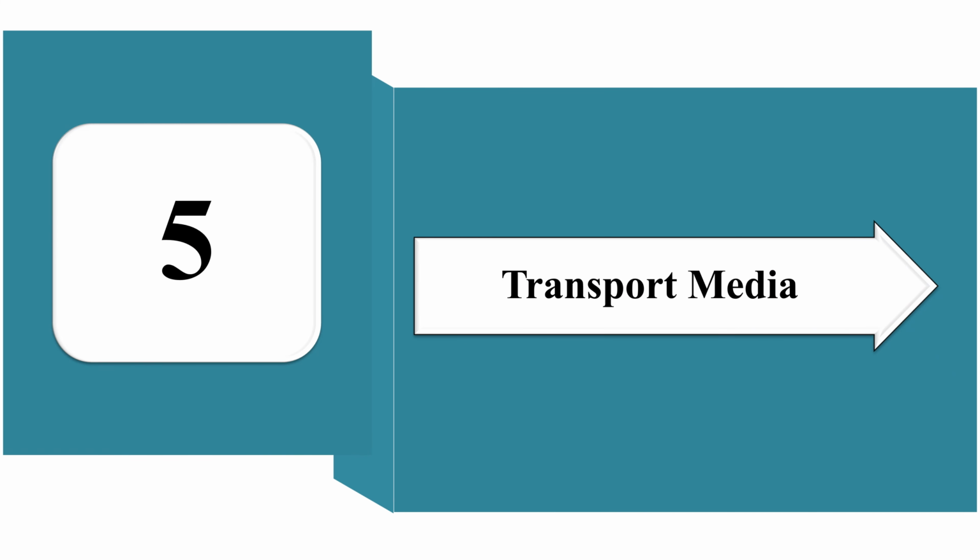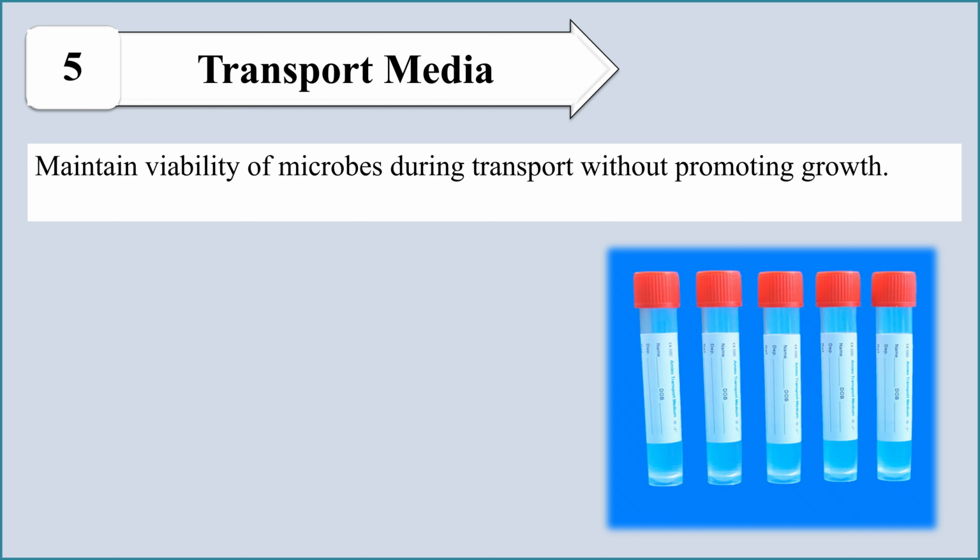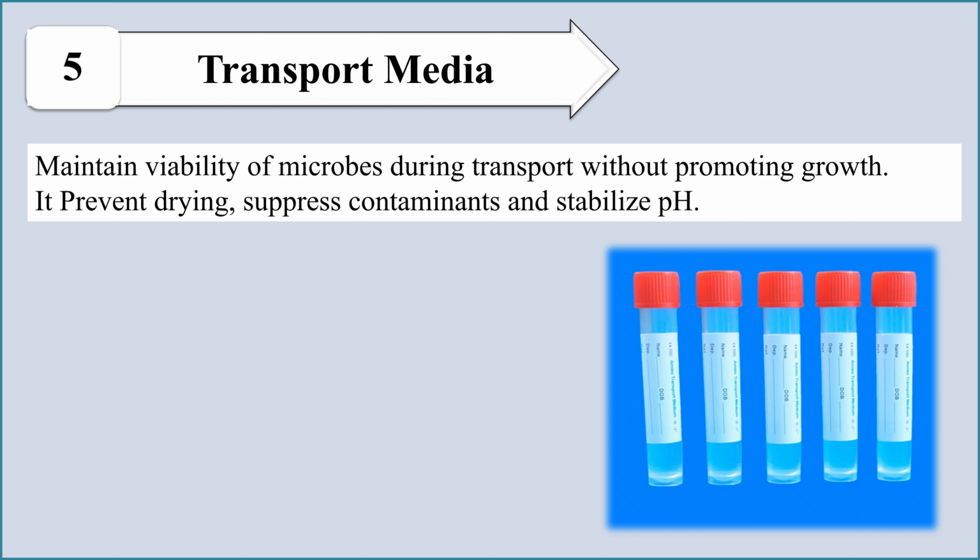What is transport media? These are the media that maintain the viability of microbes or bacteria during transportation without promoting the growth of unwanted bacteria. It also prevents drying, suppresses contaminants, and also maintains the pH of the sample.